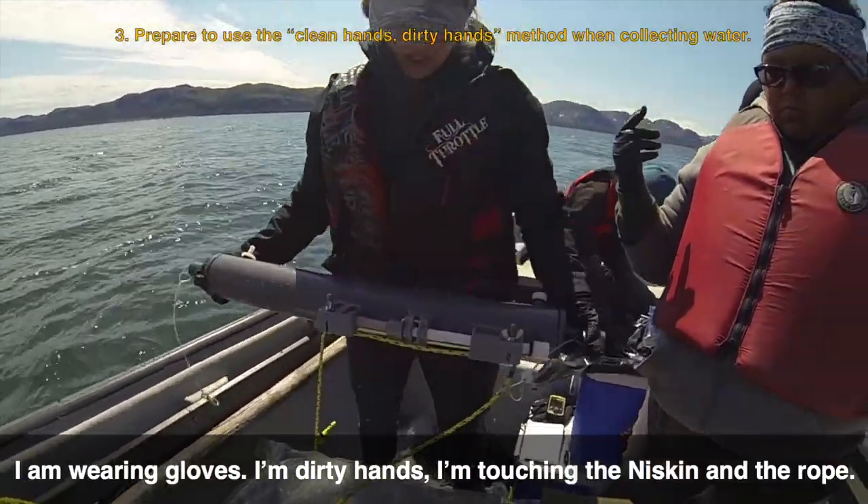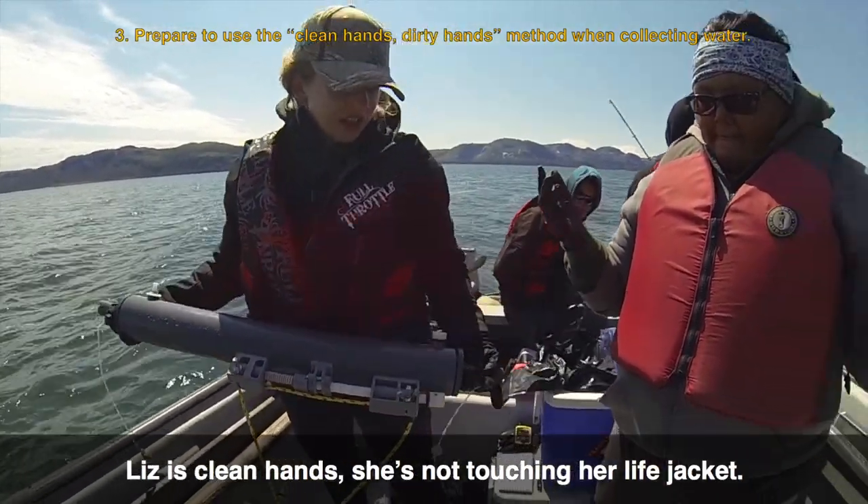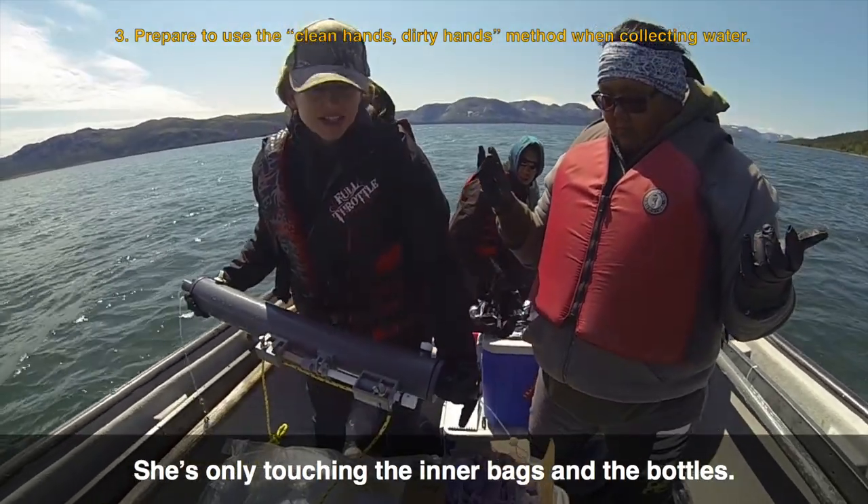So I'm wearing gloves — I have dirty hands — I'm touching the Niskin and the rope. Liz is clean hands; she's not touching her life jacket, she's only touching the inner bags and the bottles.